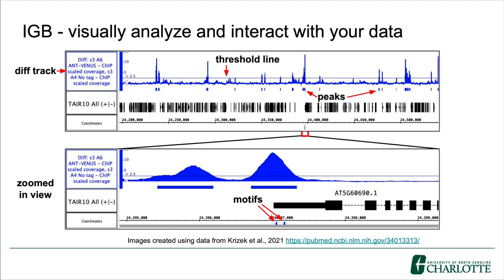I then set a user-defined threshold of 2.5 to help me identify peaks of interest. Finally, I zoomed in to a particularly tall peak and used IGB's advanced search to find predicted motifs. Of course, IGB has many other features, and we are adding more functionality, including through the use of pluggable apps through the IGB App Store.